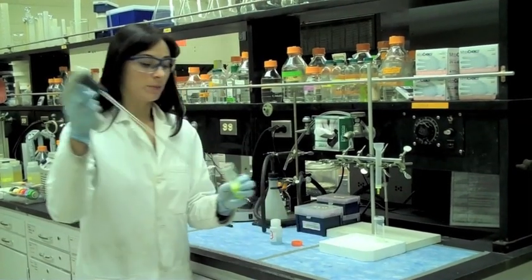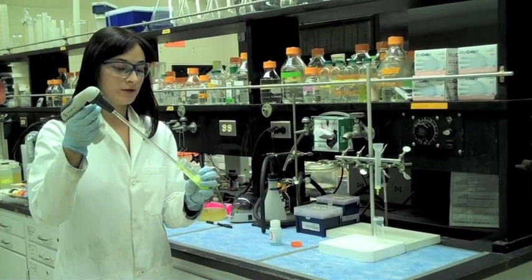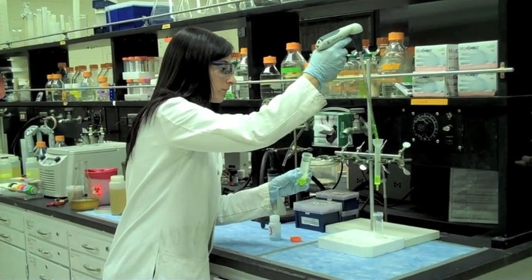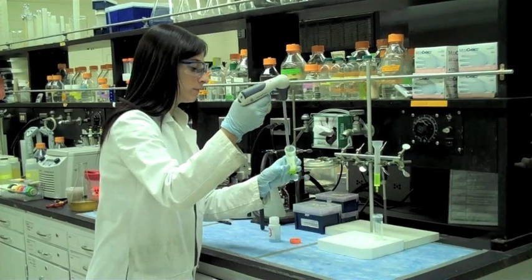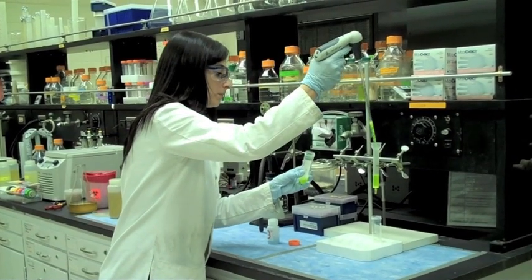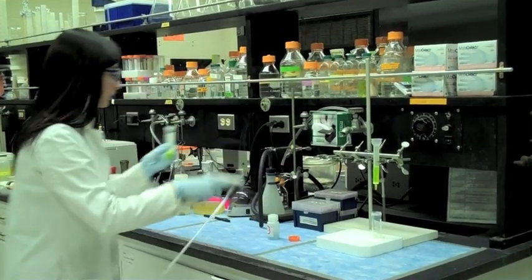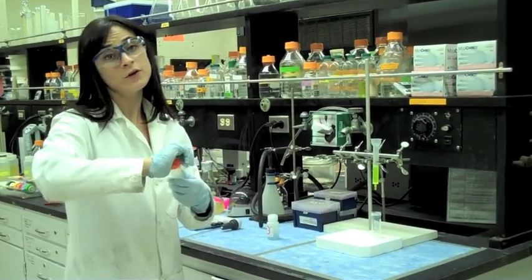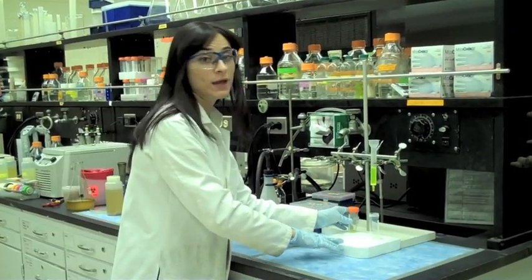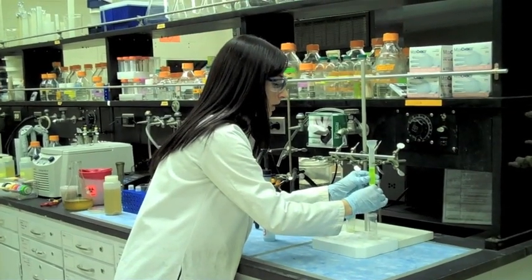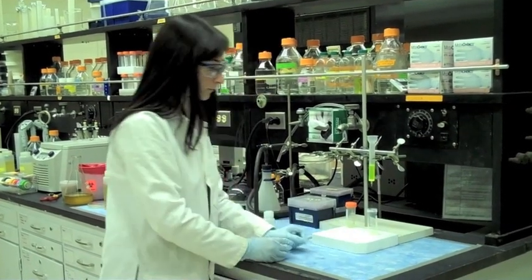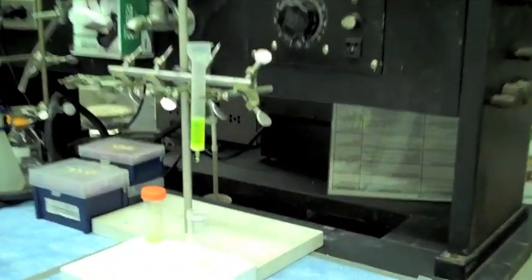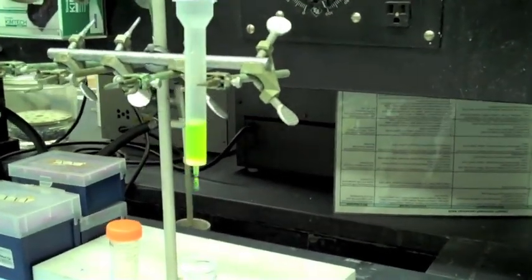Next, we will apply the incubated beads and lysate to a column. The first step is to collect the material that does not bind to the nickel beads. If there is a large amount of protein, we may have some excess protein that cannot bind. This material will be our flow through.